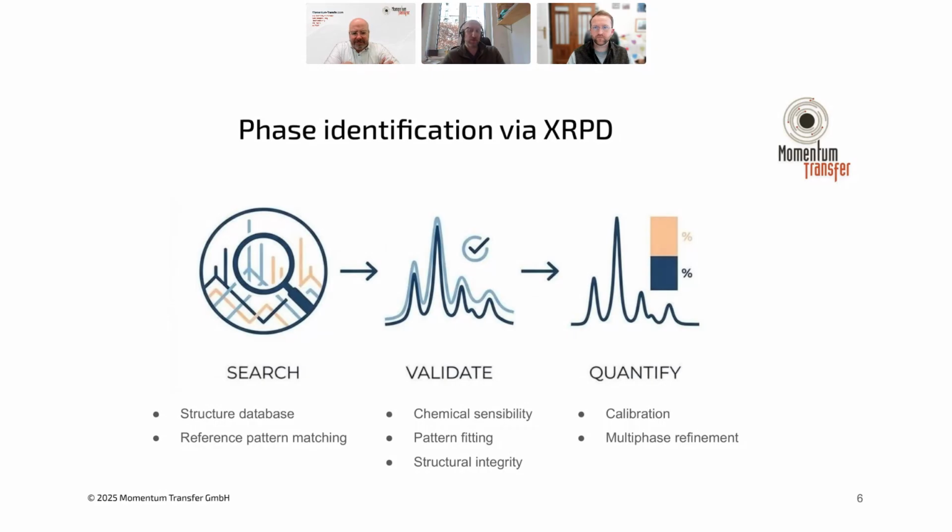There are other methods which involve pattern matching. It's also possible to develop your own database of experimental patterns and match against those as well. Maybe many of you know that we're also building an open measurements database for that purpose. I also won't be specifically talking about that today, but it's coming online soon and will provide more features to our search capabilities.